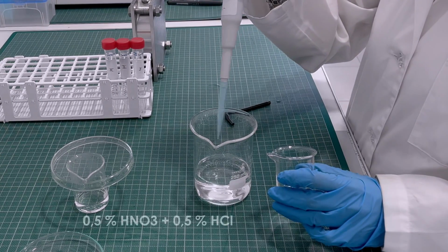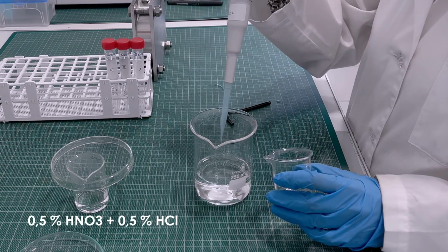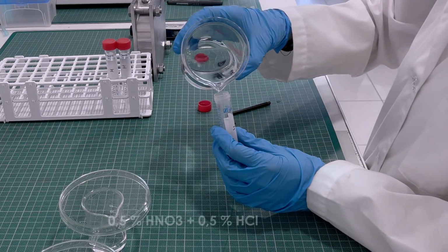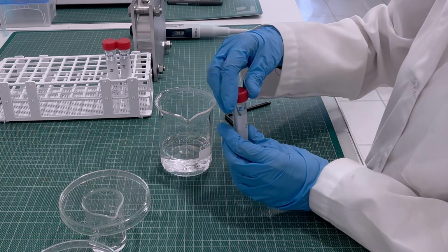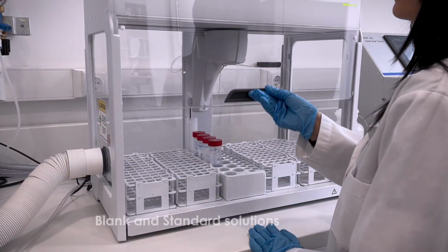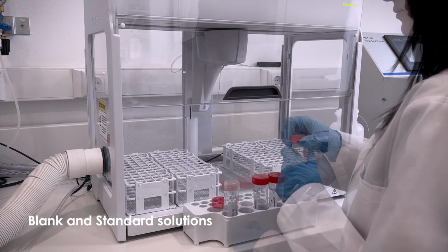After the incubation period, simulants are properly acidified with nitric and hydrochloric acid to dissolve and stabilize the migrated metals. These are then placed in the auto chamber of an ICP-OES instrument.